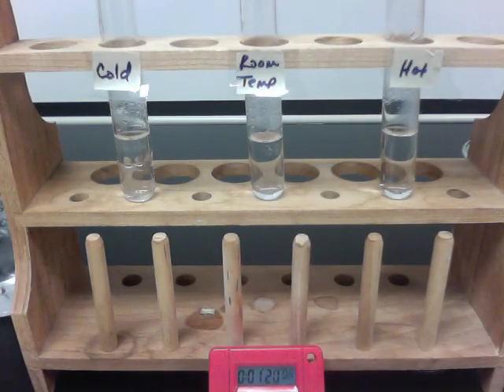Okay, so as you can see, the warmer the acid, the faster the reaction takes place. The colder the acid, the slower the reaction takes place. Now, can you relate this perhaps to something that we studied during our first quarter of 8th grade science? Perhaps the kinetic molecular theory of matter? I think there's a question on your lab that asks you to make that connection.